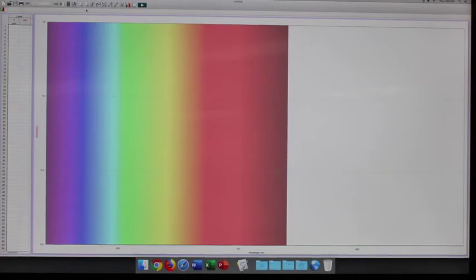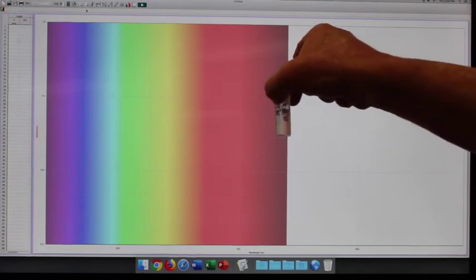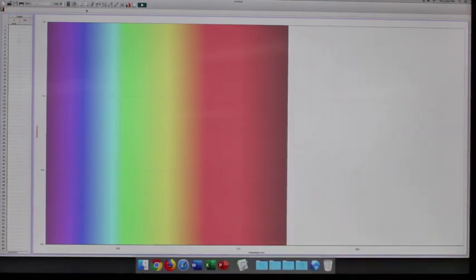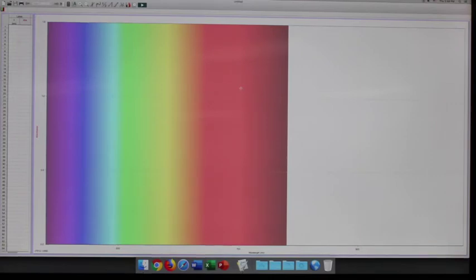So to start with, I'm going to take straight water. This is our blank DI water. Place it in the spectrometer. Go up here to experiment, go down to calibrate, and calibrate the spectrometer. Now I already warmed it up, so I can skip the warm up and finish the calibration. Okay, it only takes a couple seconds to calibrate. Then I'm going to hit OK down here.